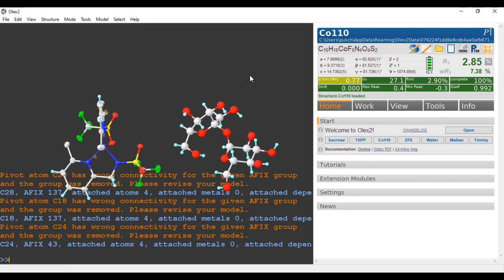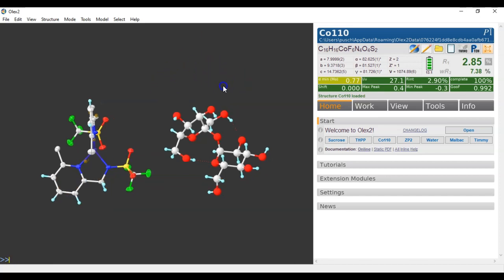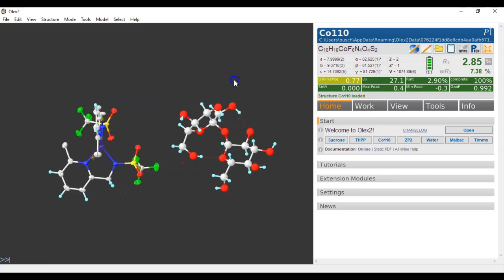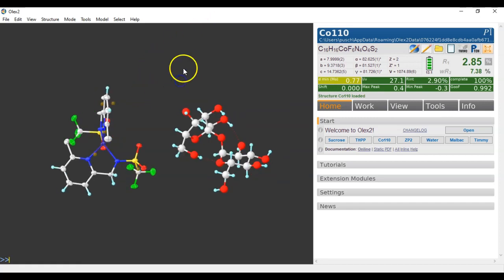We just type clear and that gets rid of the output text. The nice thing is you can now save this as file c o e x whatever dot x y z. So I've now saved this as this structure regardless of the space group.